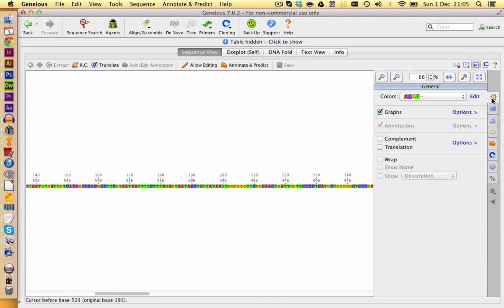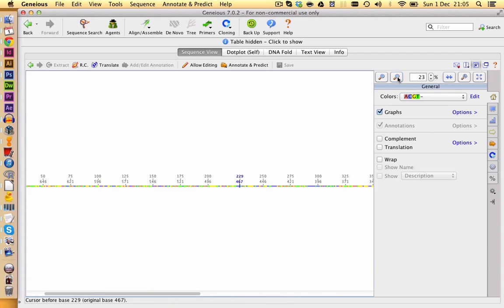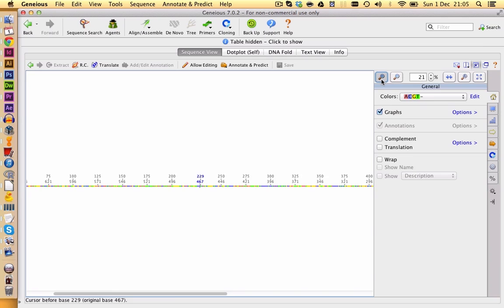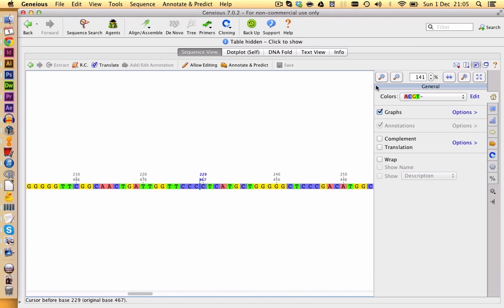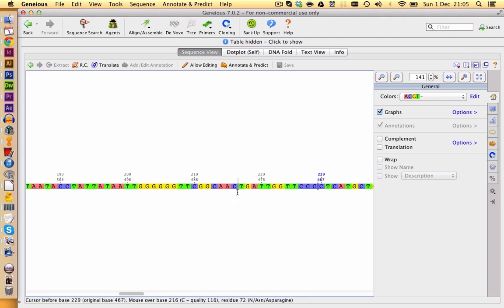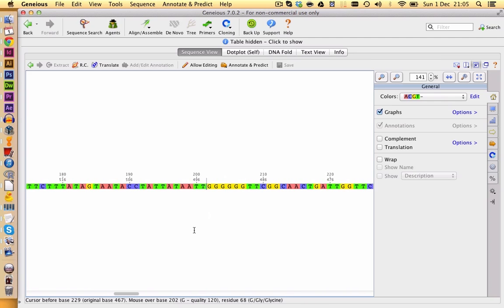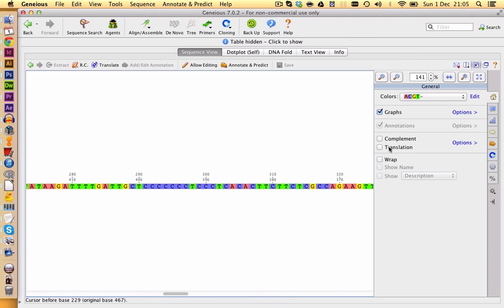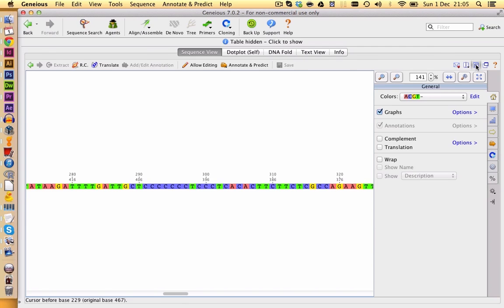One really basic function, which is really important, is the zoom in and zoom out. So this is to enlarge the view of your sequence, so you can get a view on the part you want to have. You can scroll around with your mouse wheel or you can just use the slider down here. Let's reduce the size of this view again.